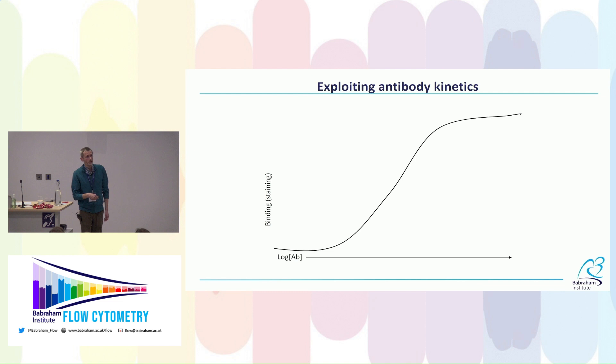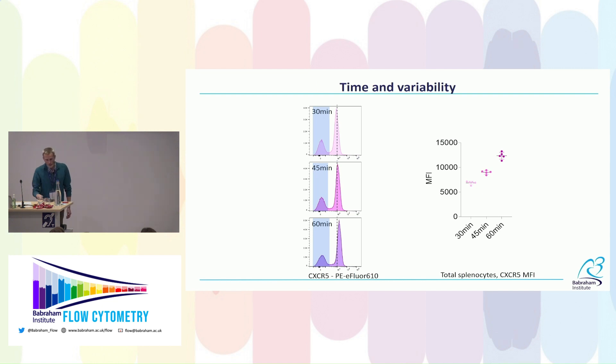Factors like pH, temperature, and time can change the position of the sigmoidal curve. We tend to think incubation time isn't a big issue because staining happens quickly, and on a logarithmic axis a two-fold increase doesn't look like much. Here I'm showing mouse splenocytes stained for CXCR5 at 30, 45, and 60 minutes — typical incubation times — and you can see staining is still going up over time, so it's not clear we've labeled all the molecules even at an optimal antibody concentration.